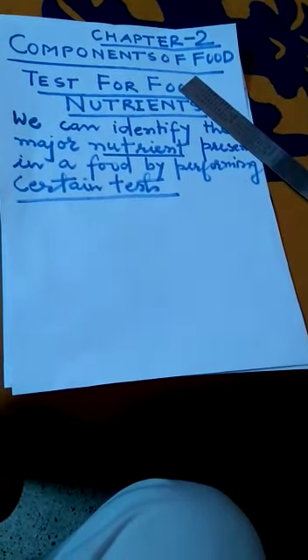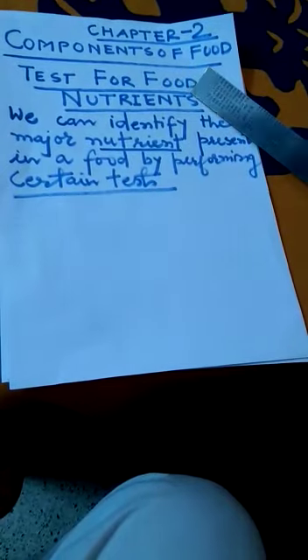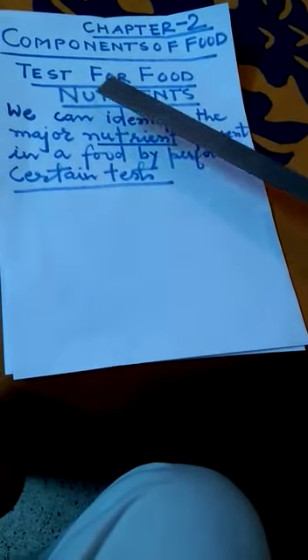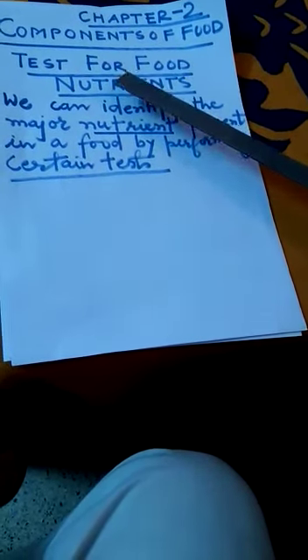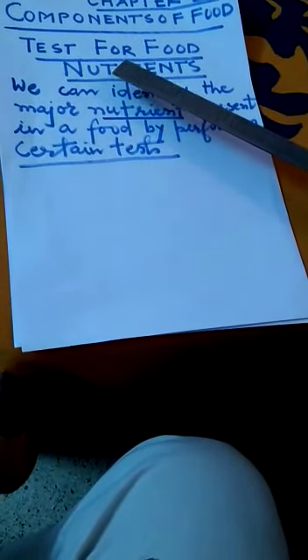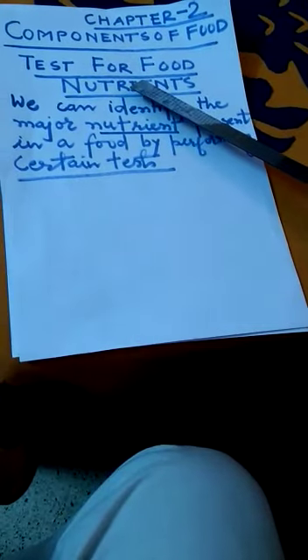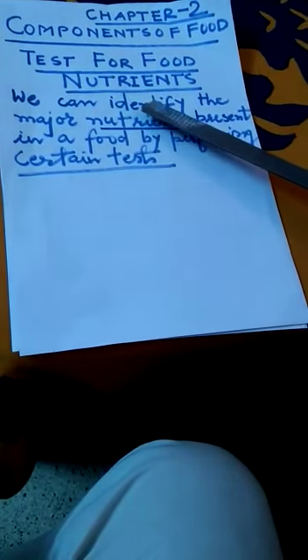Different foods contain different nutrients. We can identify the major nutrient present in a food by performing certain tests. So, today we are going to discuss the tests for food nutrients, and we can identify the nutrients present in a food by performing certain tests.